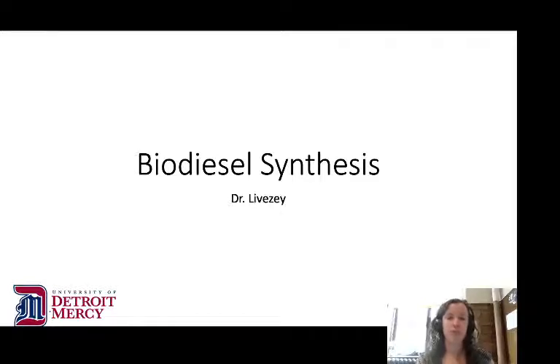This week in lab, we'll be synthesizing biodiesel. Bring your best hippie gear, folks. I want to quickly point out that if you're wanting additional clarity on the analytical data sheets, I did record a video in this folder all about refreshing ourselves on NMR and IR spectroscopy.